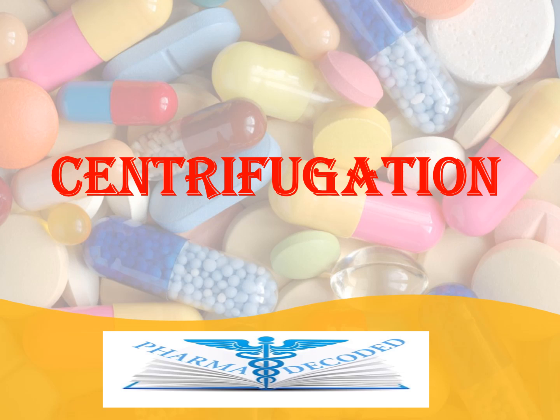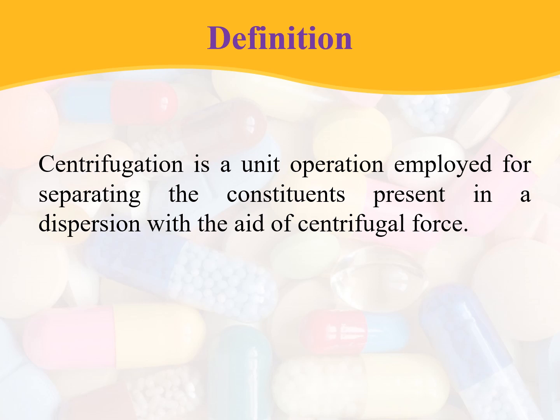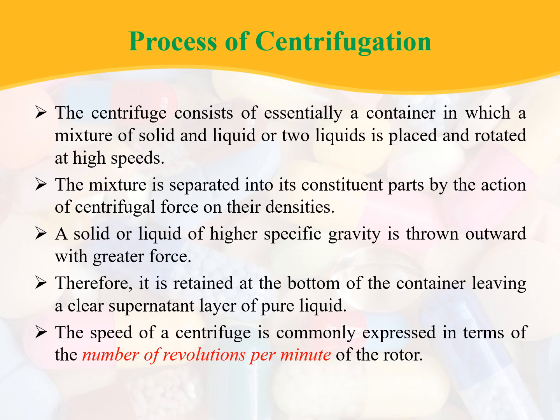Now let us discuss centrifugation. Centrifugation is a unit operation employed for separating the constituents present in a dispersion with the aid of centrifugal force.